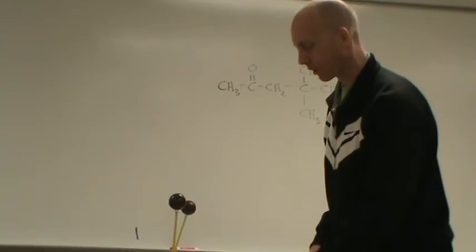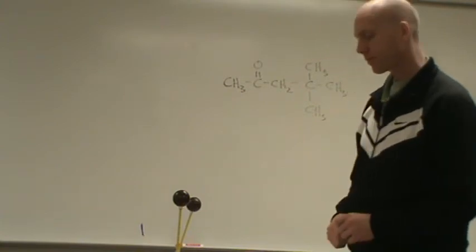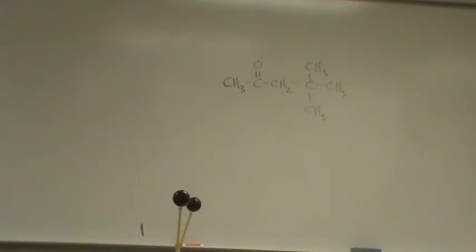Let's go through our analysis. What's the first question we should ask of ourselves? The number of peaks. Okay? How many peaks do you think this one here gives?